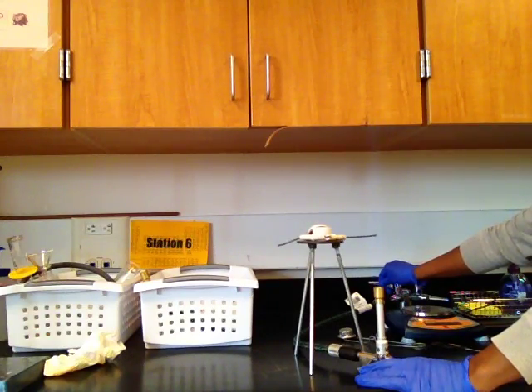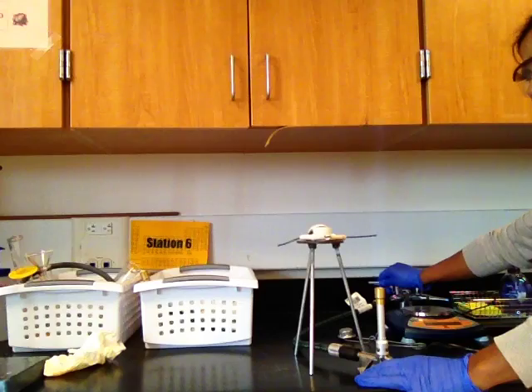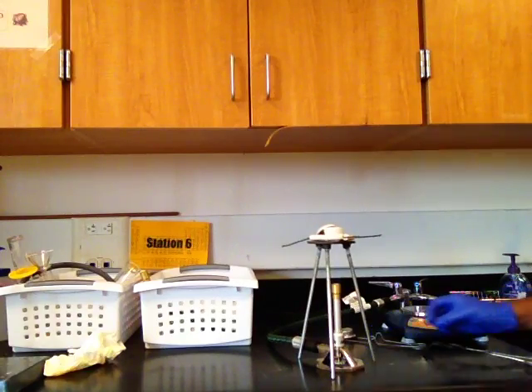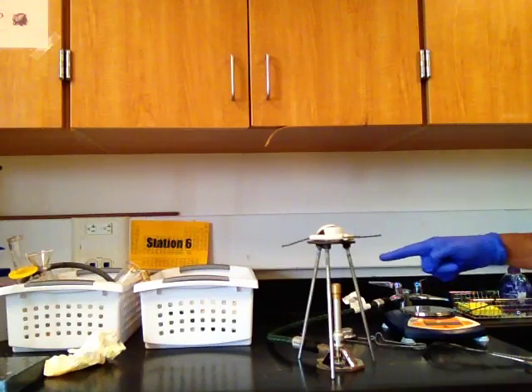Now you want to reduce the flame enough so it is about, say, 2.5 to 3 inches, and it reaches the crucible nicely. If your flame is too low, then you won't be able to purify the crucible. So first thing is you heat up the crucible. I'm not sure if you can see the flame.